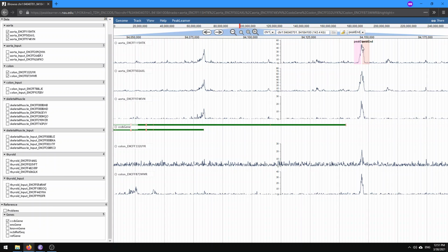and that's going to give us a model where this red bar here indicates the region where you have the peak start and the peak end predicted by the model. And so you can see that it's consistent with given labels as shown in the rectangles here.